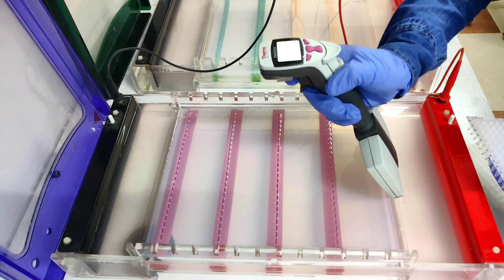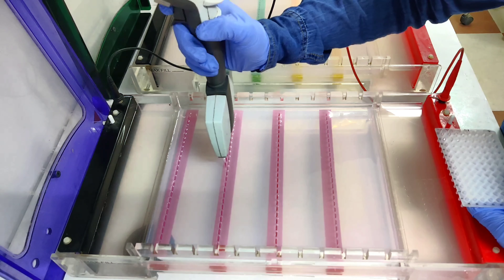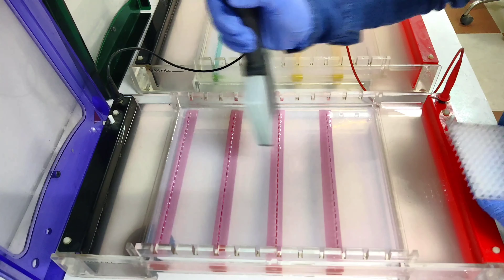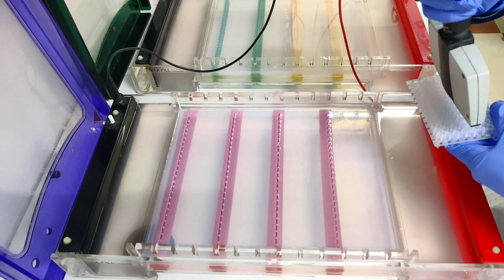You have to load it very carefully and we have to wash these tips also. I am not changing the tips because we have to save the consumables. This is very interesting — you can load two PCR products, meaning two plates, in a single gel.